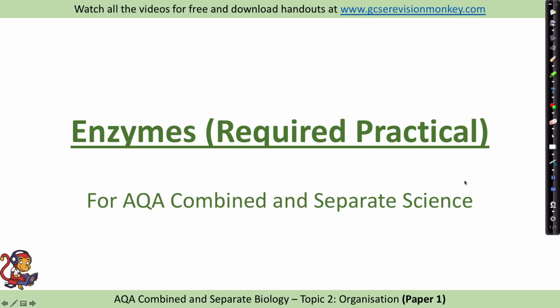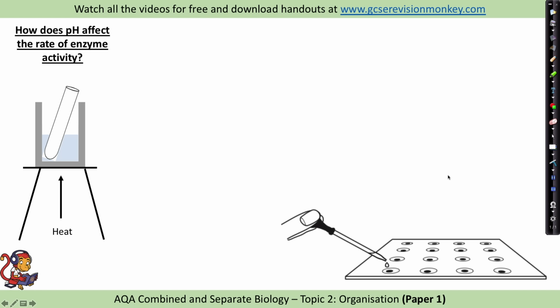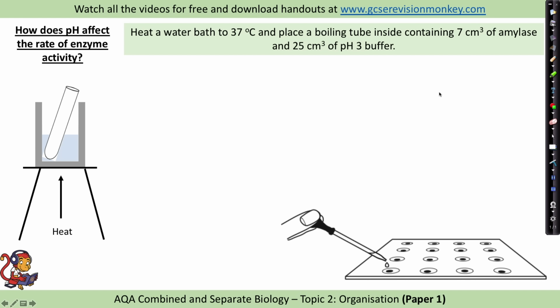Enzymes required practical. For this required practical, you will investigate the effect of pH on the rate of enzyme activity. So what we do first of all, if I take you through step by step, is we would heat a water bath to 37 degrees and place a boiling tube inside containing some amylase. So I've just given some suggested amounts here, so 7 centimeters cubed, for example, of amylase, and 25 centimeters cubed of a pH buffer, and we'll start off with, for example, pH 3.